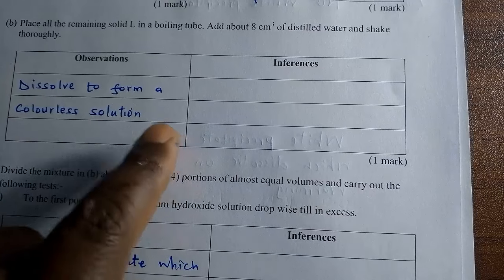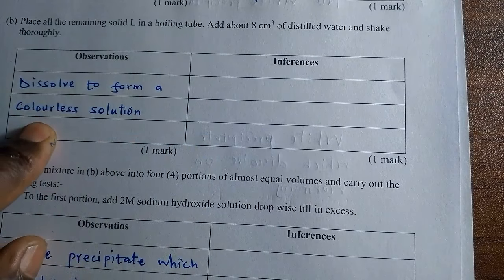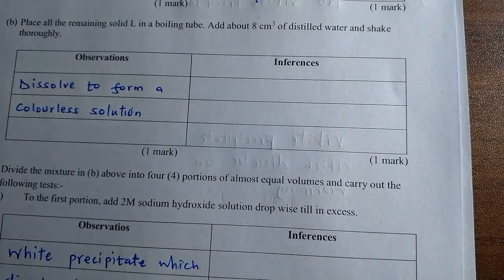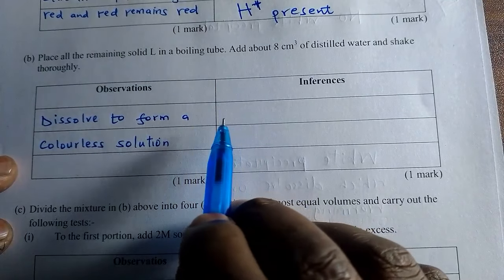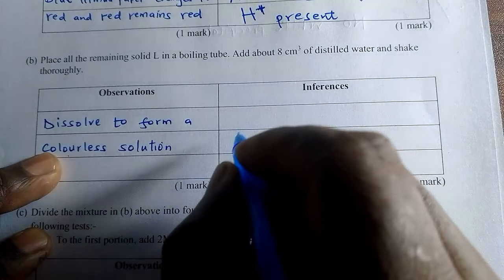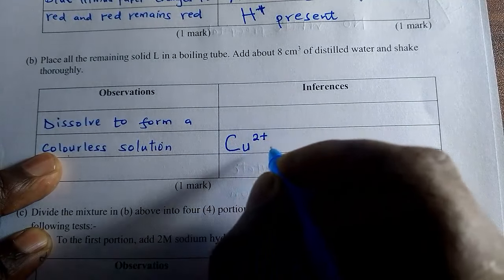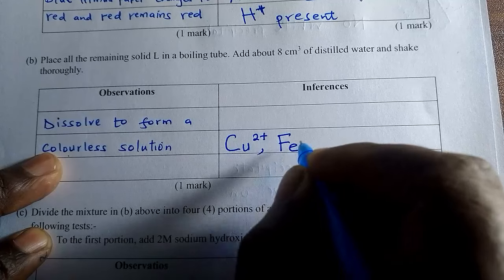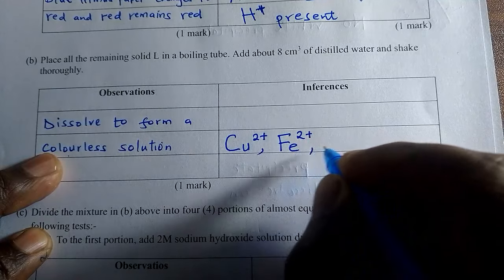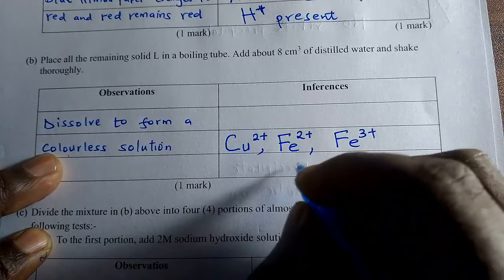If we are dealing with inorganic, here you will tell us that because it is a colorless solution, it means the colored ions are absent. Cu2+, which is blue, iron 2, which is green, and iron 3, brown, are absent.